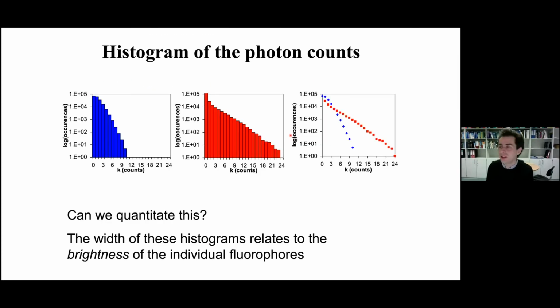And quantitatively, what you do is a histogram of your trace. Here, actually the color scale, just to make it confusing, is reversed. But basically, if the histogram of your signal, the amplitudes, Ray was saying the amplitude in the chat, if the histogram of the amplitude is fatter, then this means that your molecules are in a complex. Of course, you need a reference. If the width of your histogram is smaller, so if your histogram is thin, then this means that you most likely are dealing with a monomer.